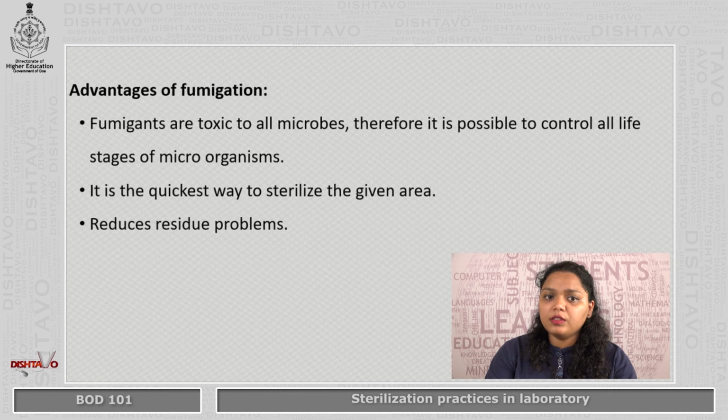Advantages of fumigation. Fumigants are toxic to all the microbes. Therefore, it is possible to control all life stages of microorganisms. It is the quickest way to sterilize the given area. It reduces any residual problems.